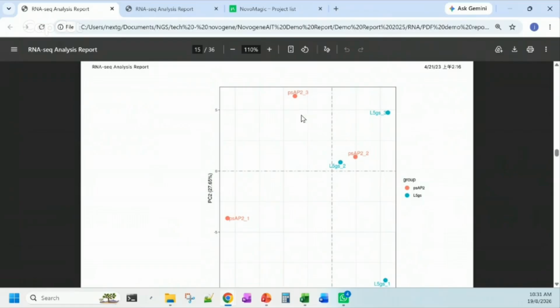So if we do not really see very high differences between sample groups, for example we don't see the nasi lemak groups before and after separating very significantly, normally that is still okay. Some researchers might be concerned that their sample groups before and after look very similar. Is this all right?